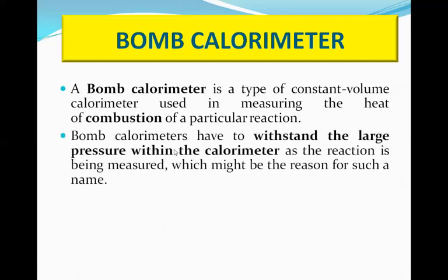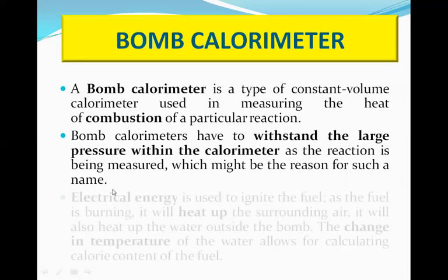Now, a bomb calorimeter has to withstand the large pressure within the calorimeter. Actually, when the substance is burned inside the stainless steel vessel, a very high pressure is produced, and as a result, the reaction is being measured at a very high pressure. So, this is the reason for such a name, that is, the word bomb is used.